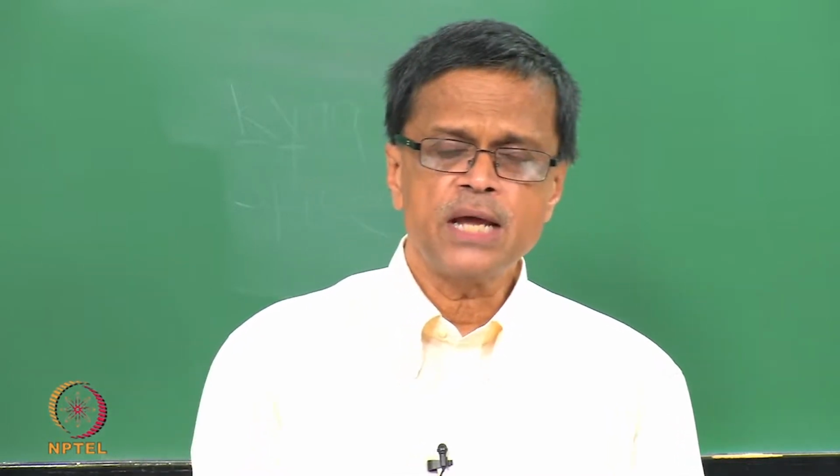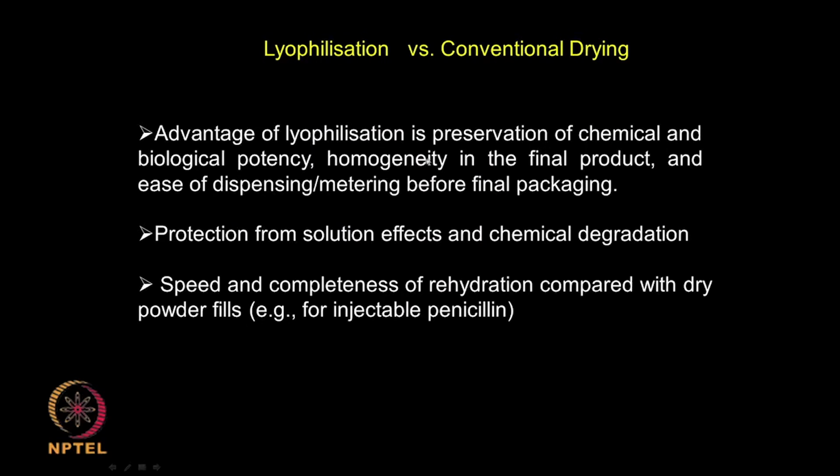Okay. So what are the advantages, disadvantages? Advantages of lyophilization: preservation of chemical and biological potency in the final product, protection from solution effects and chemical degradation, speed and completeness of rehydration compared with dry powder. Okay, it can be quickly rehydrated again following lyophilization.